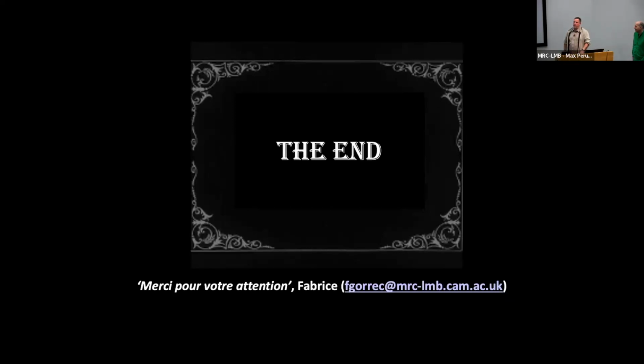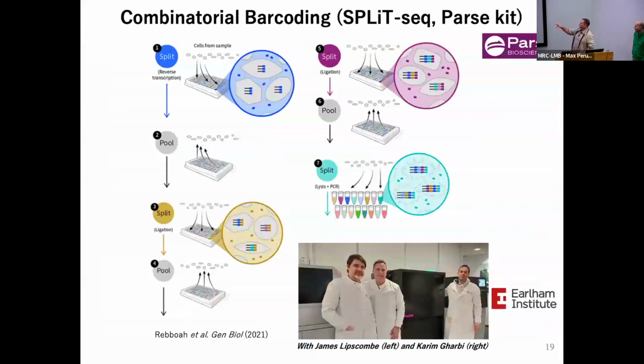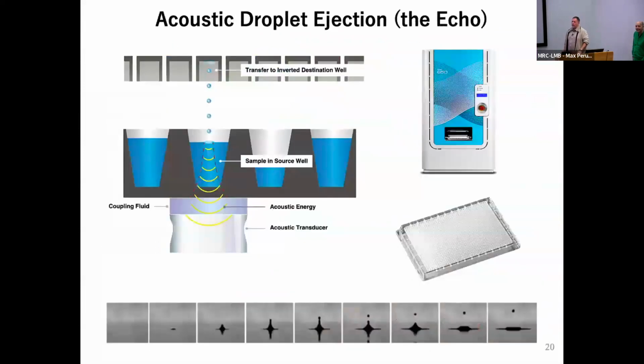They were the Echo. Yes, the Echo. Okay. Can you essentially emit a single droplet? A single droplet. So the minimum unit of volume will be 2.5 nanoliters. So one ejection is 2.5 nanoliters, and that's the minimum volume as well. And then you can do bigger volumes with several ejections on the same spot.